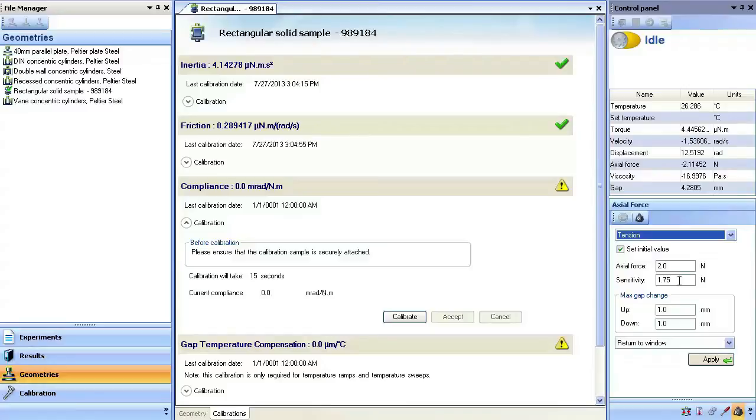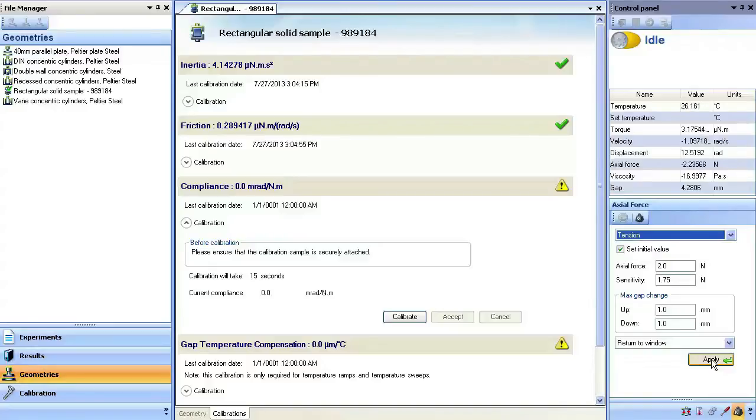There are recommended clamping torque and axial force guidelines located in the instrument help menu, but here these values will suffice. Please note that axial force is negative for tensile direction.